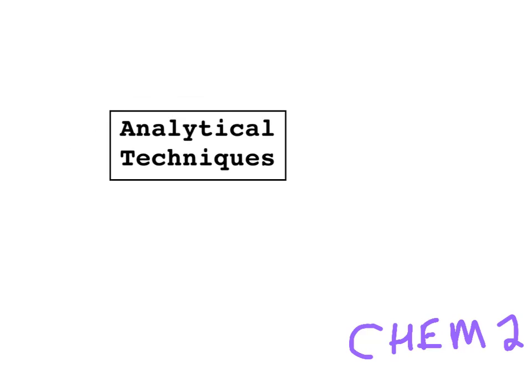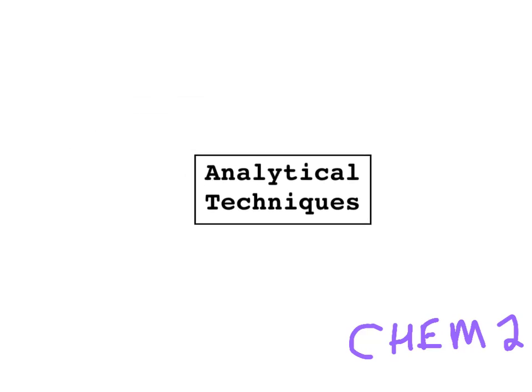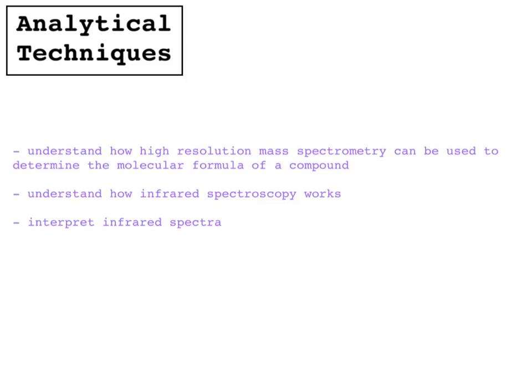This video is on analytical techniques. And our aims for this video are to be able to understand how high-resolution mass spectrometry can be used to determine the molecular formula of a compound, understand how infrared spectroscopy works, and to be able to interpret infrared spectra.